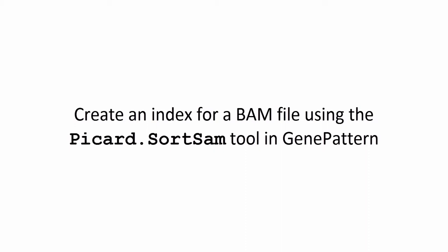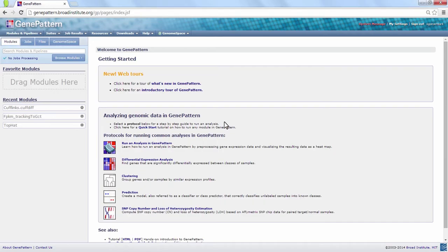Hello from GenomeSpace. In this video step, we will create an index for a BAM file using the Picard Sort Sam tool in GenePattern.